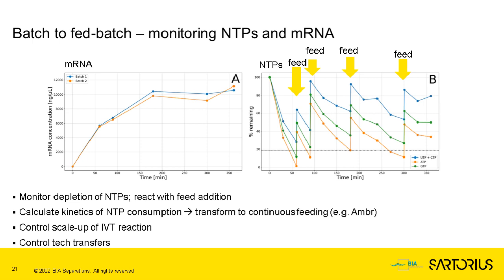Well, we have tested freeze-thaw stability of these samples. So if you were to take samples at every minute, freeze them, you can then analyze them offline and let's say fit the data back into the kinetic plots. So that's also possible. But if you want to respond to an ongoing reaction, then the recommended sampling time is approximately 10 minutes. And then you can respond to the reaction progression in real time.